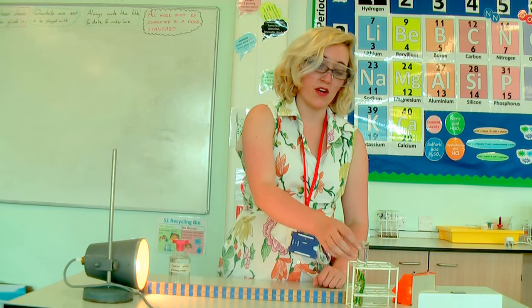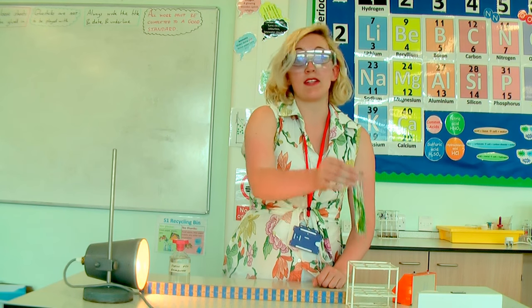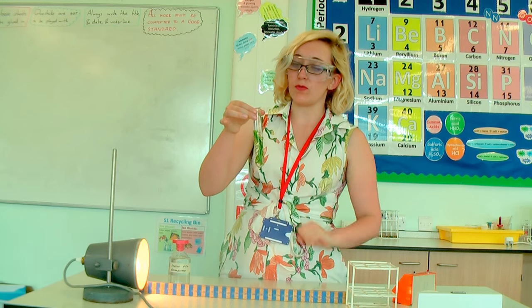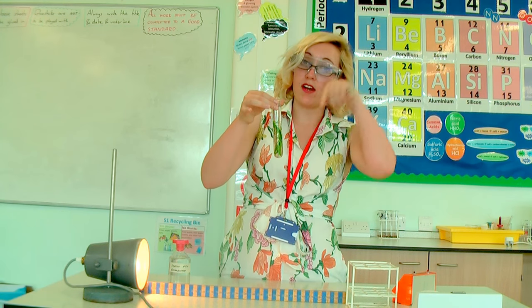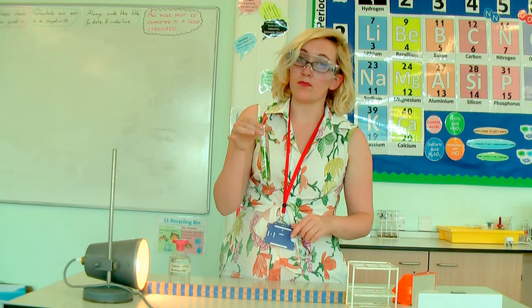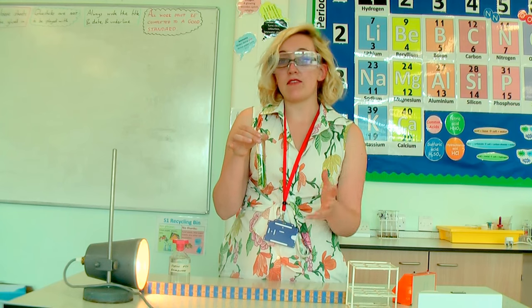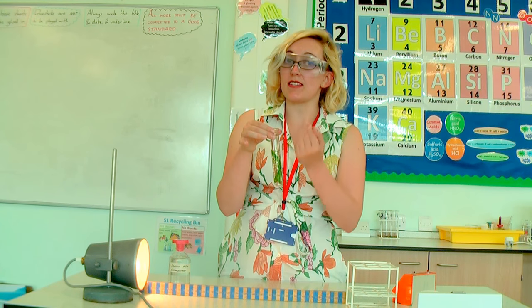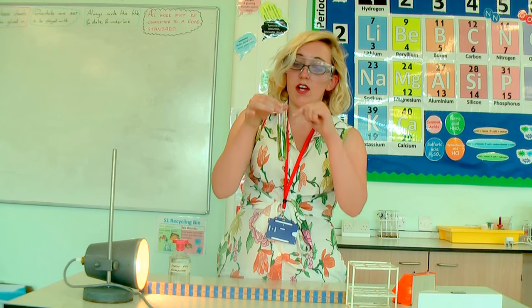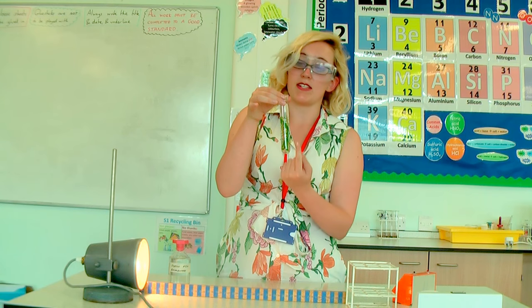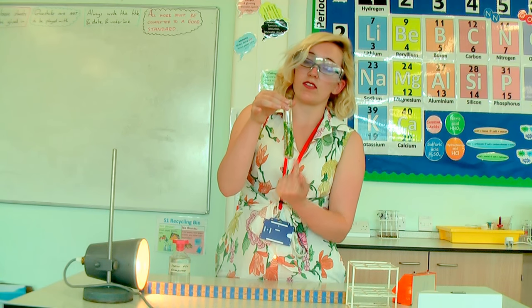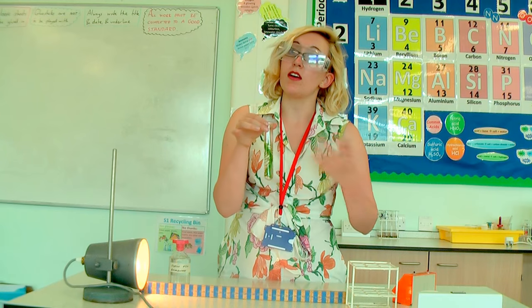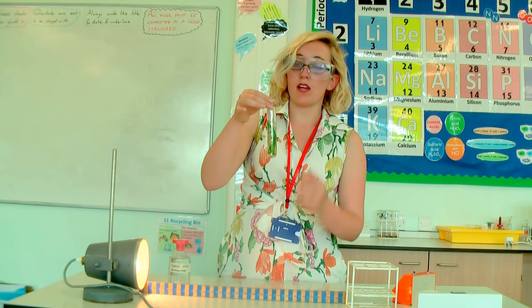In this boiling tube I have already cut myself about a 10 centimetre length of the pondweed and I have put it upside down. You should already know that leaves have holes in their undersides, which is where the gases come out of. So if I put the pondweed upside down, the gases are going to come upwards and it's going to be easier for me to count the number of bubbles that I have.